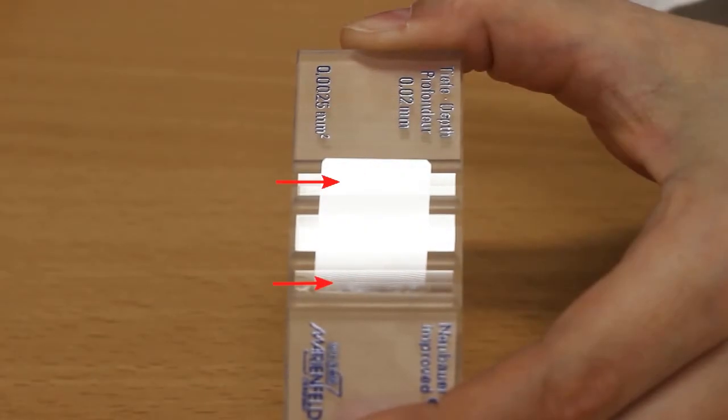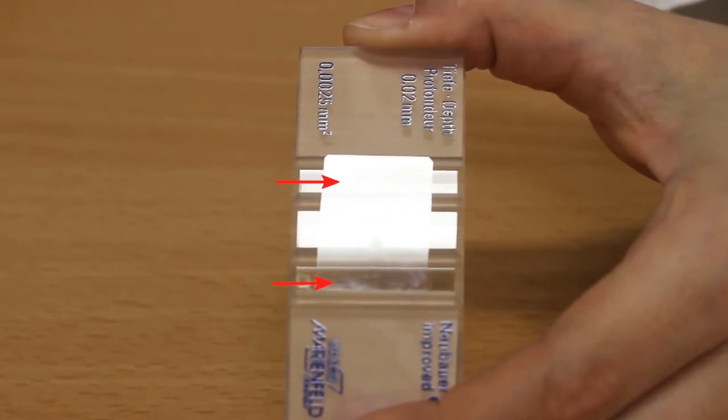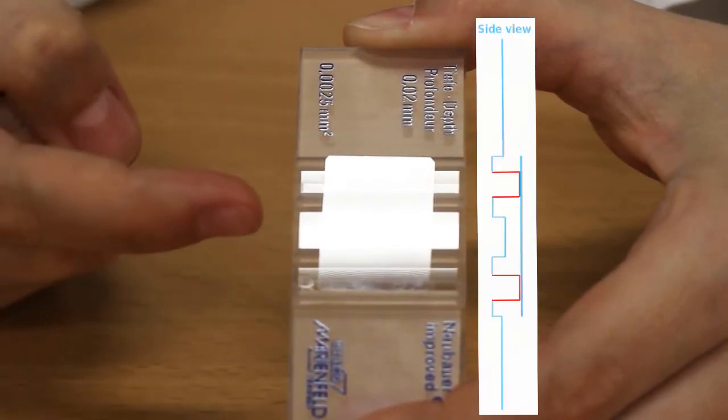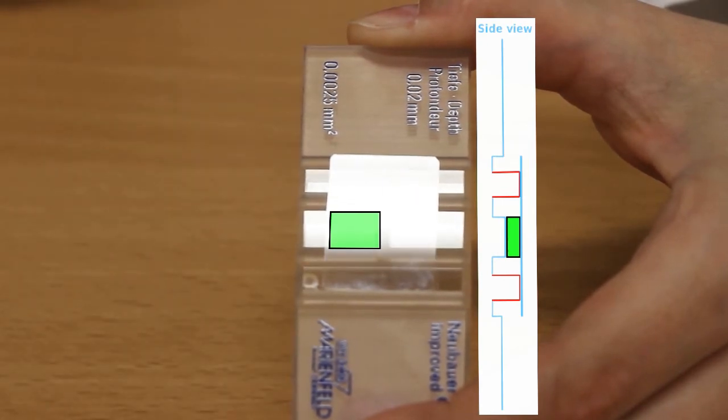If the coverslip is placed correctly, ring-shaped interference patterns called Newton rings can be observed. A chamber of defined height is created between the coverslip resting on the support structure and the sample below.